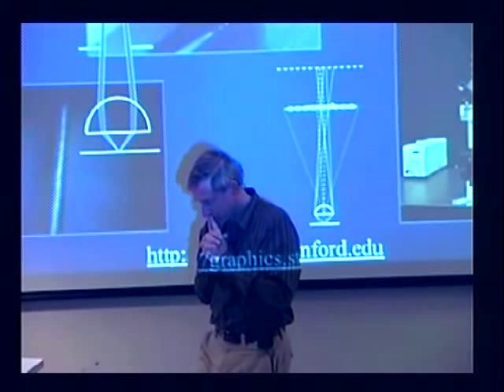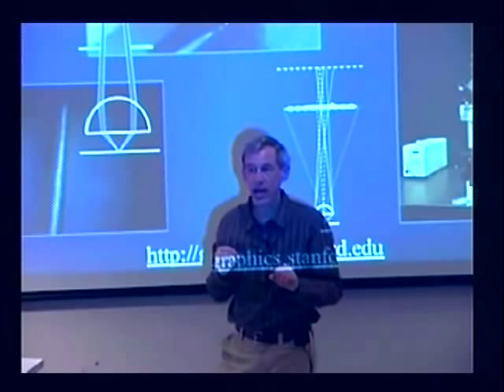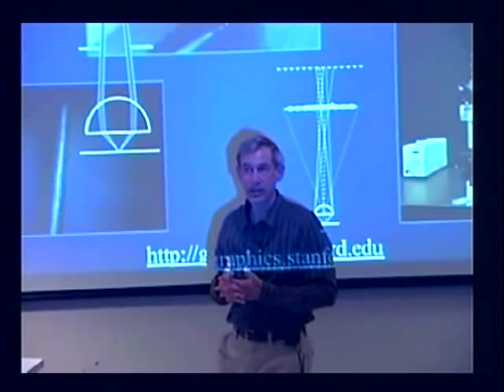All right, well, let's see. So work with me on this for a minute. There are techniques for being able to take a focal stack and extract both amplitude and phase. I believe they only work under coherent light, meaning a laser. But it's a technique in microscopy called quantitative phase microscopy. And so the focal stack does give you that information.